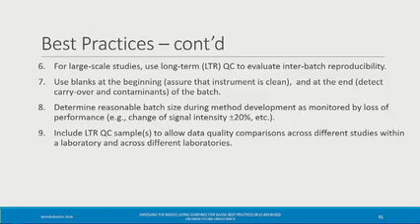So it's like chemically pure compounds. Yes, so it could be chemically pure compounds, or it could be pure compounds spiked into a biological or environmental matrix. Different labs use either simple mixtures or complex samples or both. We had about, I think, 30 to 40% of labs use both. They have one authentic standard mixture and one more complex sample as well.